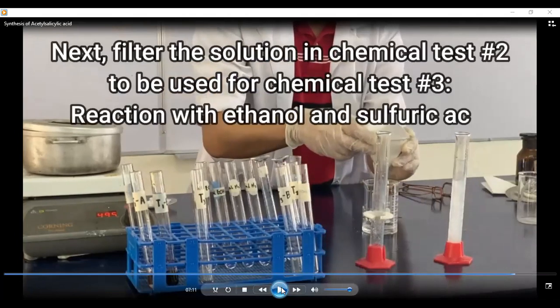So experiment 2 is connected to number 3. The product of chemical test number 2 should be filtered. Then the filtrate, the liquid in your receiver, is what you will undergo the reaction with ethanol and sulfuric acid.